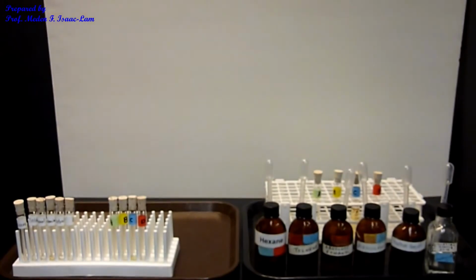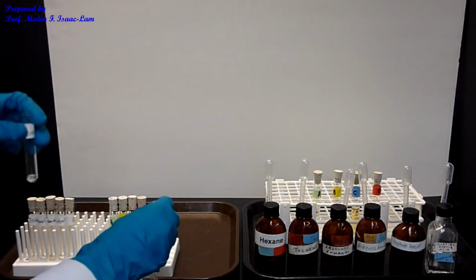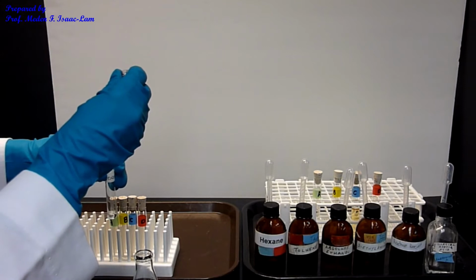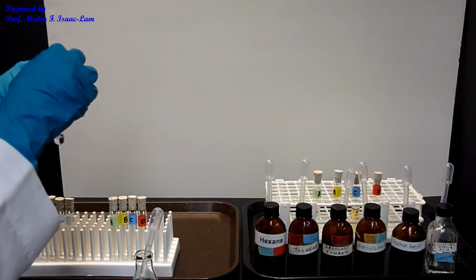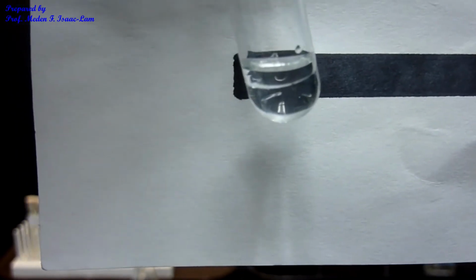I'm going to add 10 drops of the water to hexane over here. Mix a little bit so you can see that layer on top. So this would now be insoluble or immiscible. So hexane and water.